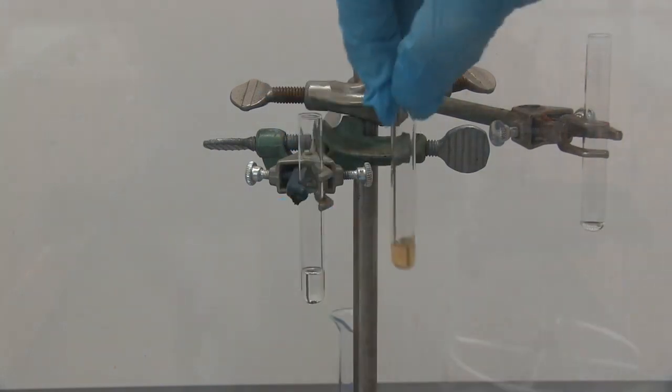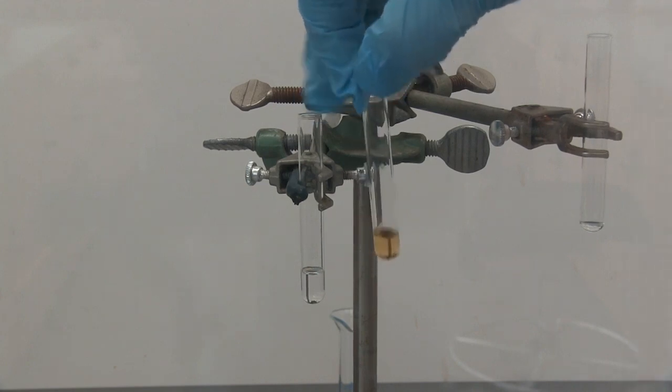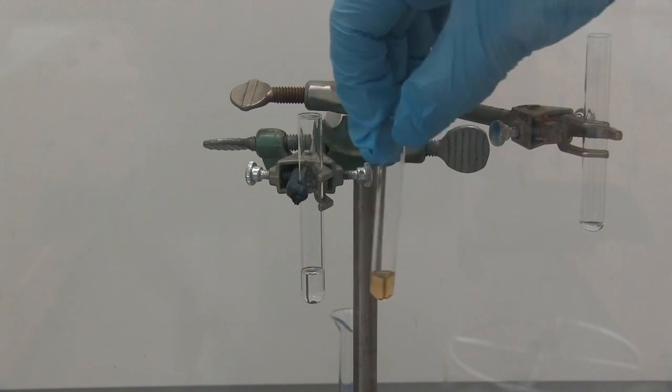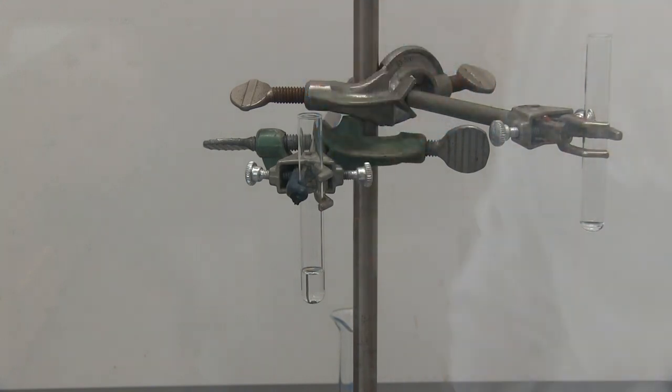You can look again at the color change of these two products. So bromine went from light yellow to clear. For potassium permanganate, it went from a purplish violet color to a yellow color. Next, you'll be given an NMR spectra where you can determine the ratio of the alkenes that are formed. There's two possible alkenes. So that NMR spectra should give you the ability to determine the ratio of the two alkenes.